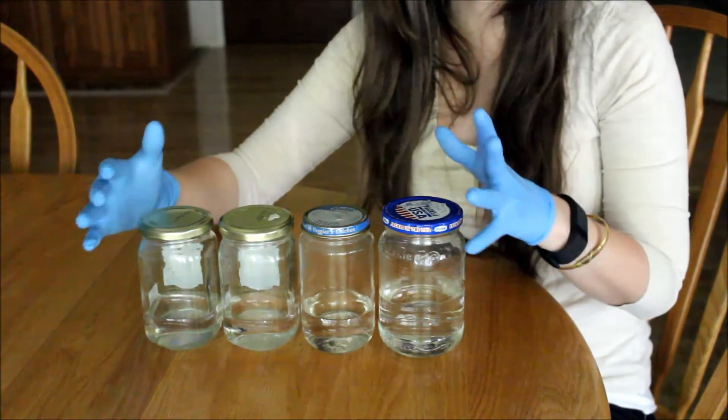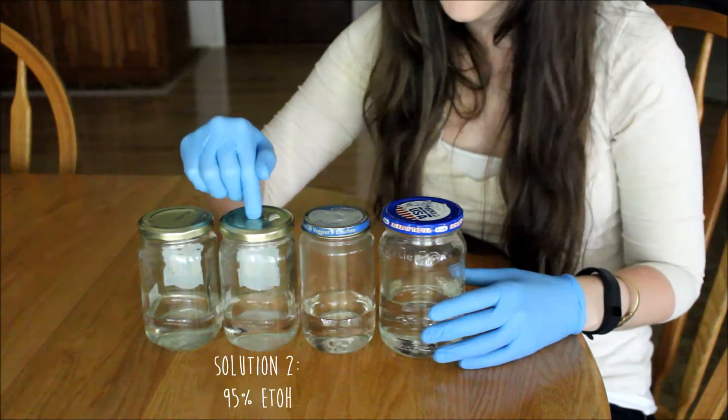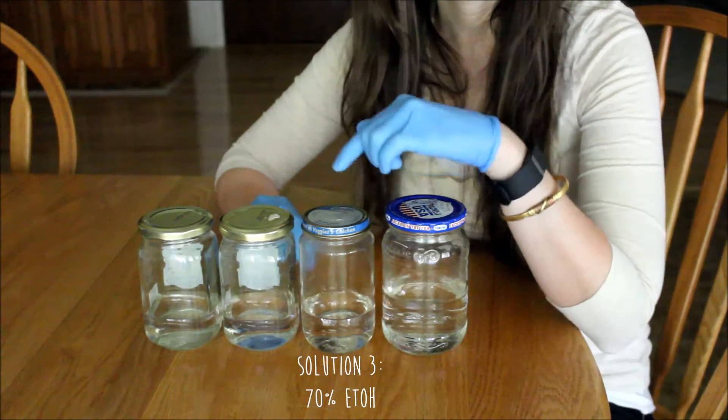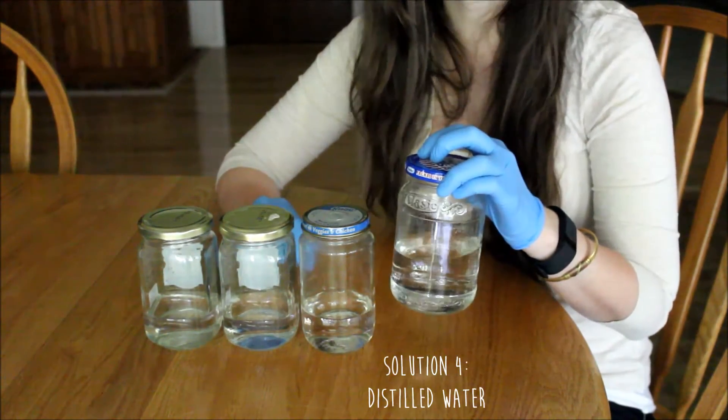So here are the four solutions: in the first one we have 95% ethanol, in the second we also have 95% ethanol, in the third we have a 70% ethanol mixture, and in the last and fourth one we have just distilled water. Now that we've finished preparing our solutions in our four jars, you need to grab your labels and a pen so we can label our jars bath one, bath two, bath three, bath four, and we can also label what's inside of them. We won't date them right now, as you're going to want to date them when you put your specimen into the solution.